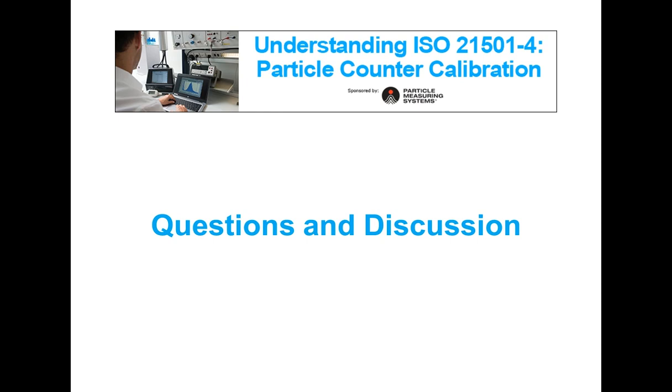I think that the manufacturer calibration is something that you must trust and you should consider feasible, while third-party calibration may be accepted, but you should prove that the third-party calibrations are performed using the right standard, following the right procedure, and you need to make sure that any third-party laboratory performing your calibration has the ability not only to calibrate your instrument, but also to adjust the counting and the sizing threshold of the instrument.